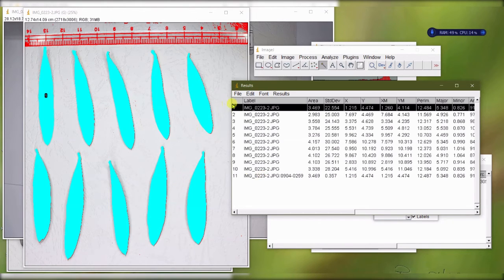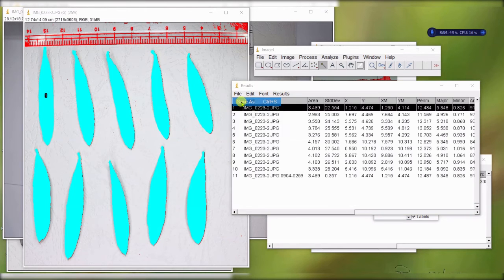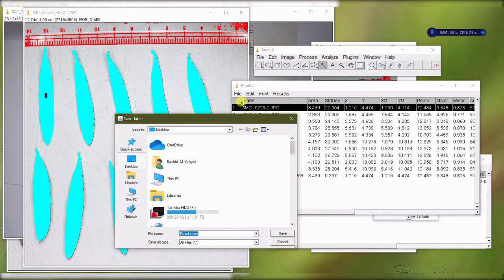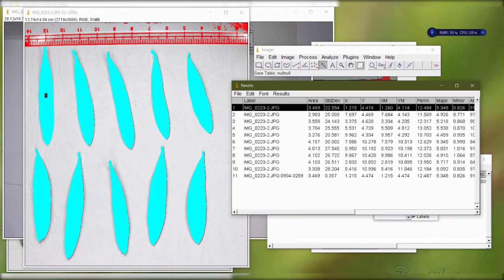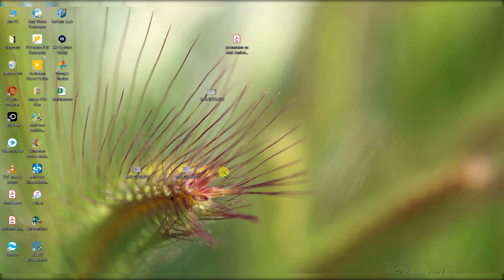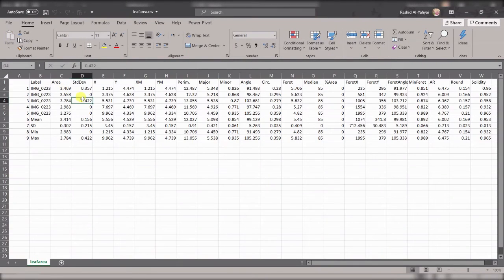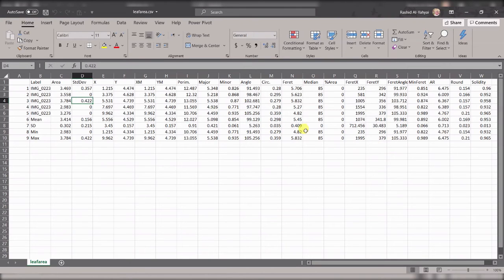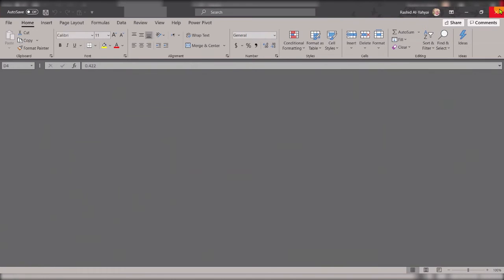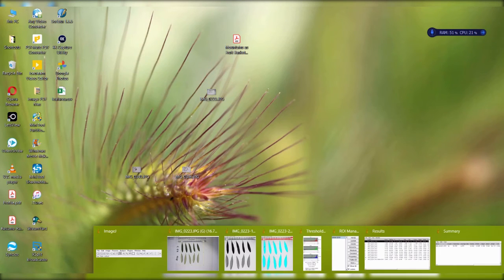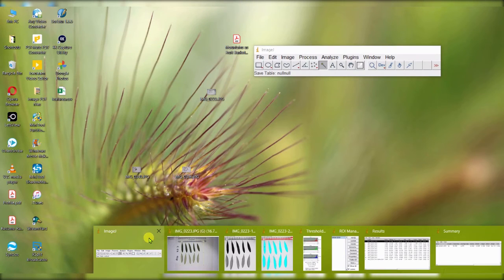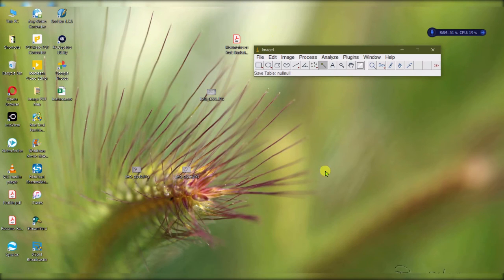You can easily save this file as a CSV file. Then once you are done, you can open that file like here it is in Excel, and you can do whatever you want with it. You can see a whole bunch of information here. So that is how you use ImageJ, the wonderful software that will substitute your leaf area meter.